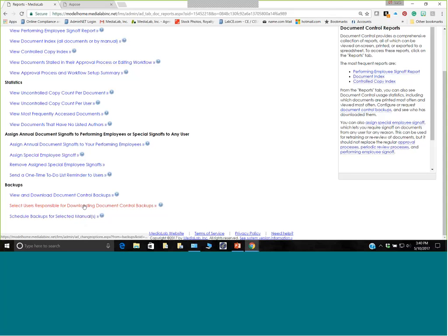So you'll select the person that's responsible for downloading that, and you'll select a frequency if you want that backup done weekly or if you want it done monthly. So we do have a really nice process, and that will make IT happy too. A lot of folks will put that right back on their shared drive.